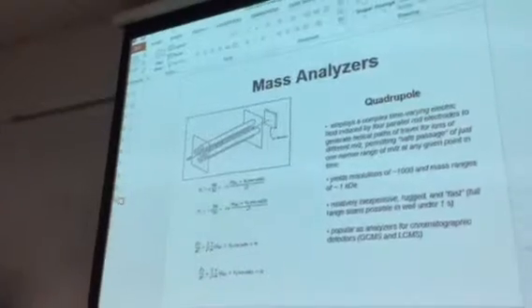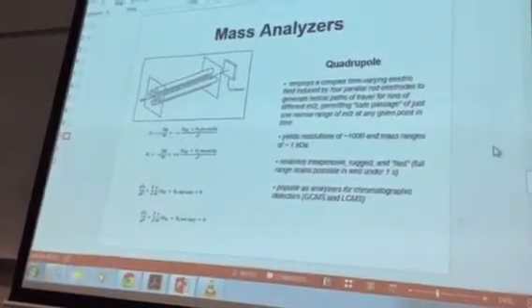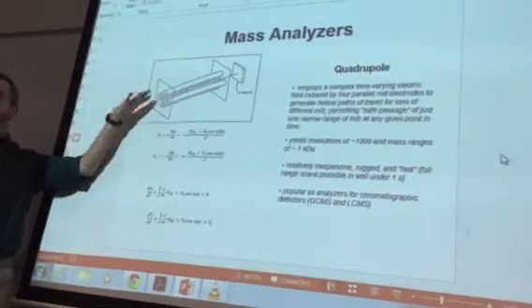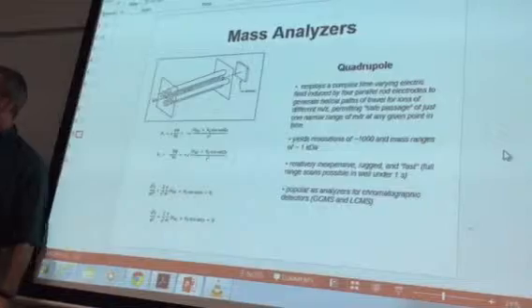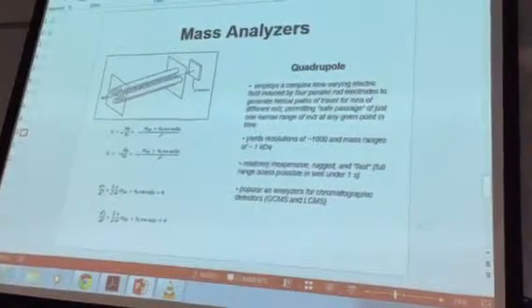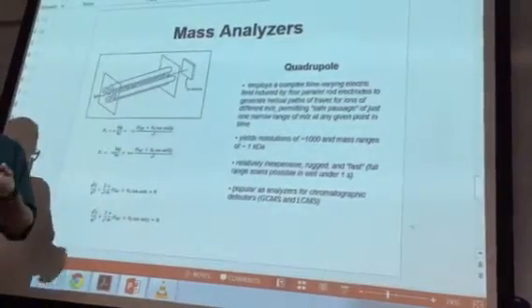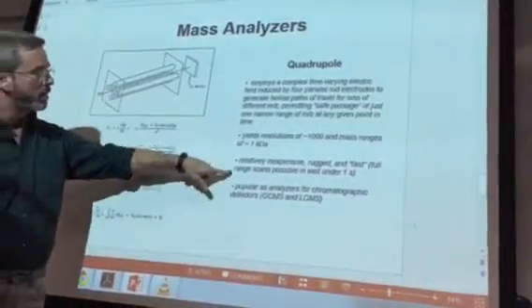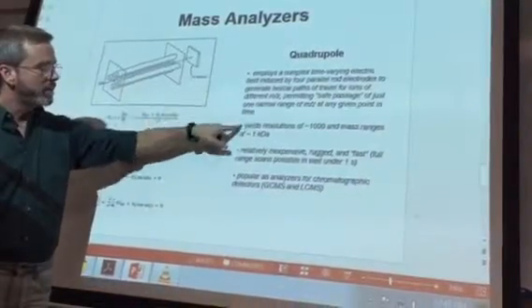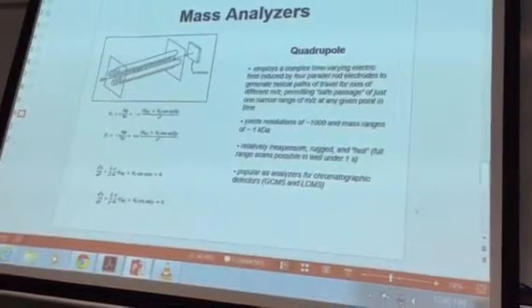And so again, it's a matter of inducing a change in the direction of travel based on mass to charge ratio. In this case, it's by a more sort of complex phenomenon. The parameters, I haven't really been harping on this, but they are here. I hope you guys review these slides multiple times along the course of considering a given module's content. But these slides here hit on some of the basic figures of merit for these mass analyzers.